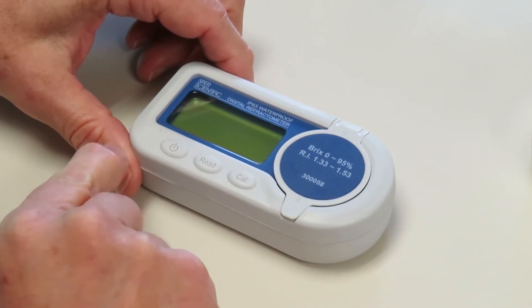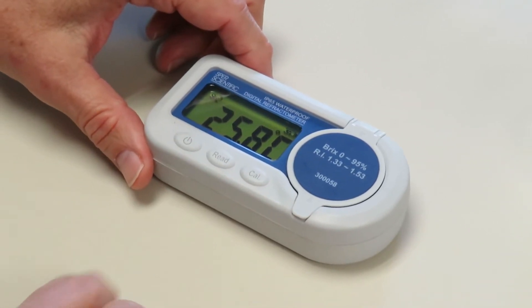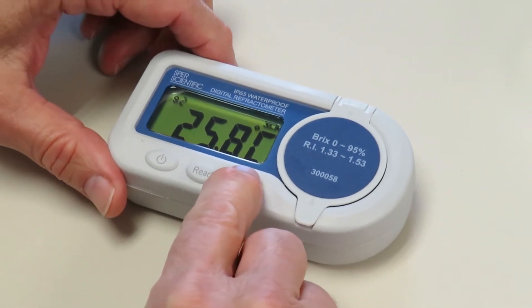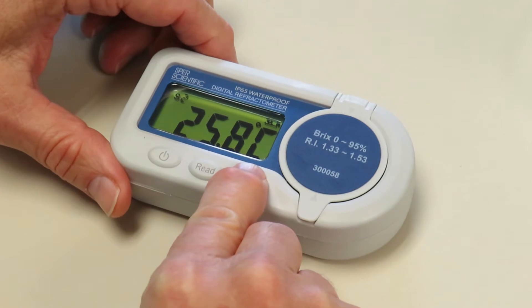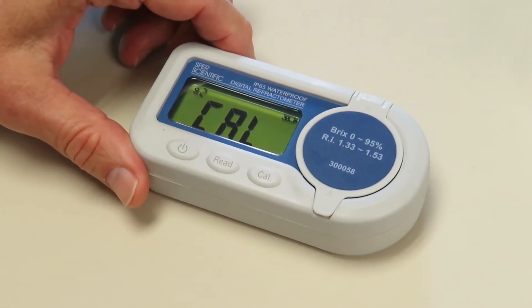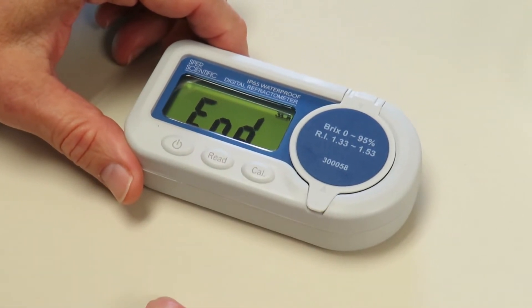Then we turn the unit on, and the first thing it does is it shows us the temperature of the sample, and now we calibrate it by holding down the calibration button for a few seconds. And once we see the words Cal, we know that we've calibrated it to zero, which is distilled water.